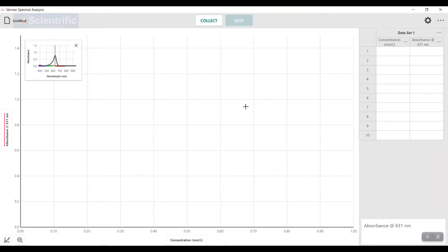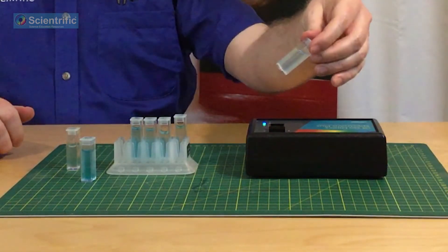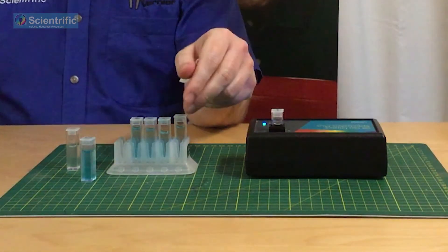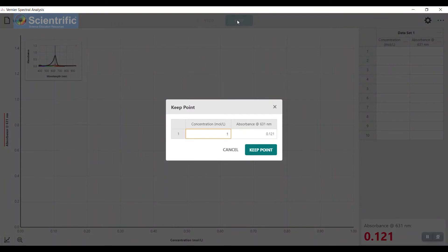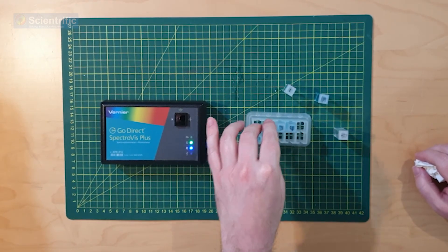I went initially with the darkest one, but now I'm going to step back and go to my lightest solution. I've done a serial dilution with these — concentrations are 1, 1.5, 2, and 2.5 molar. I'm going to hit Collect. The first thing I want to do is keep an eye on the absorbance reading — I want it stabilized. It's nice and stable, so I'm going to hit Keep and tell it the concentration: in this case it was 1. In my data table, we now have 1 and its absorbance. I'll take that out and pop in my second one.